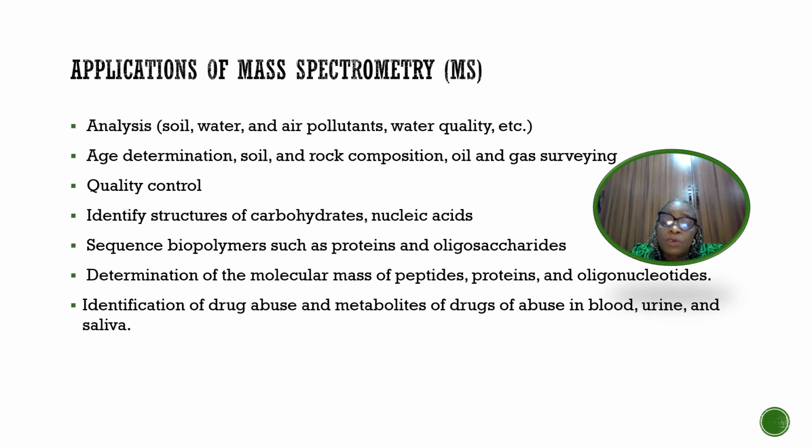Is used for isotopic analysis, that is, identifying different isotopes of elements. Useful for the determination of unknown compounds and analyzing complex mixtures. And it is very useful for quantifying the amount of known substances, etc.